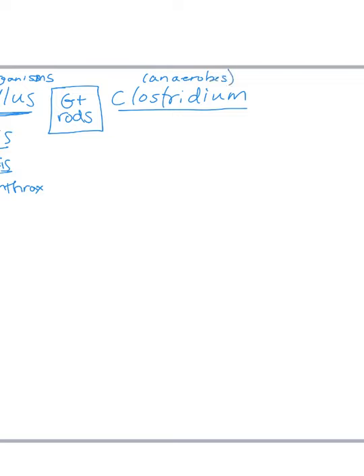In terms of what cells we're going to be staining in class, some semesters we stain Bacillus subtilis, some semesters we use Clostridium sporogenes. I don't know at this point which one we'll use. We always used to use Bacillus subtilis, and then we started having trouble getting that organism to actually sporulate, so it wasn't terribly exciting when we did our stains. So more recently, we've been using Clostridium sporogenes. It's one of the Clostridium that are non-pathogenic.